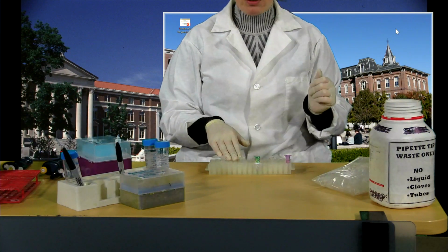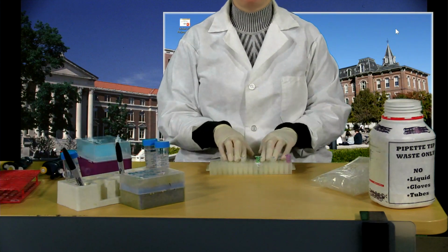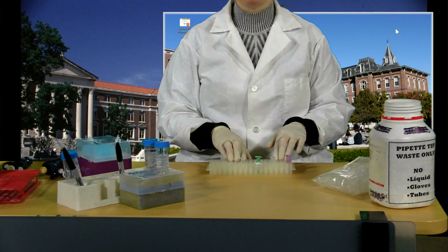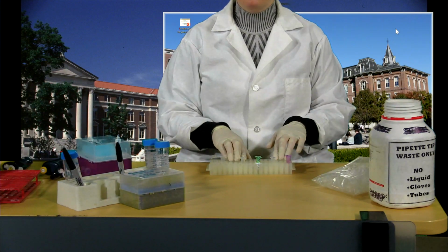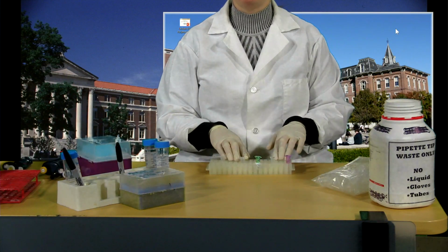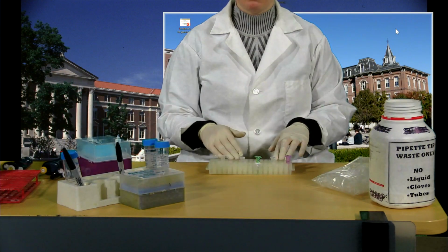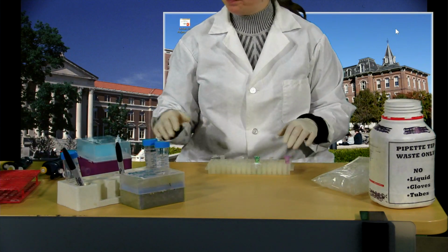The other thing to remember is the time. The important thing here is that all of our samples incubate for the same amount of time. If you let your samples incubate for a minute longer, that might not be a disaster for your experiment, as long as you know the amount of time that your assay was incubating for. If it's 6 minutes, that's fine, as long as you know it was 6 minutes and you don't then take 5 minutes forward into your calculations.